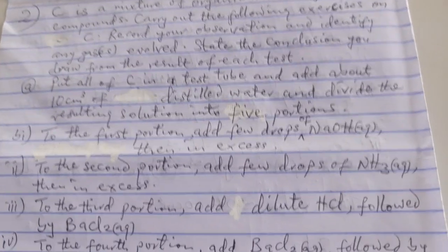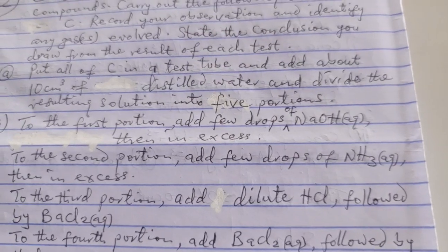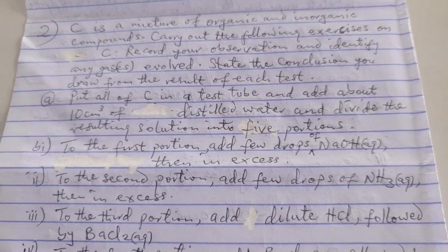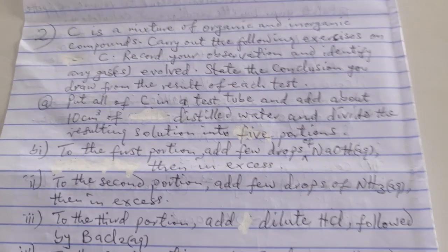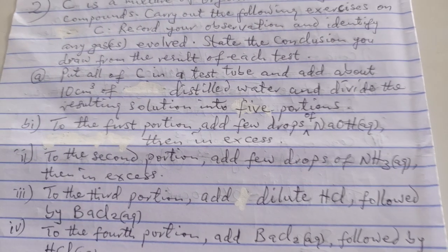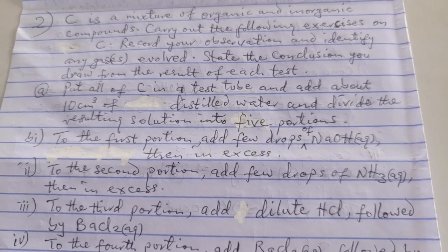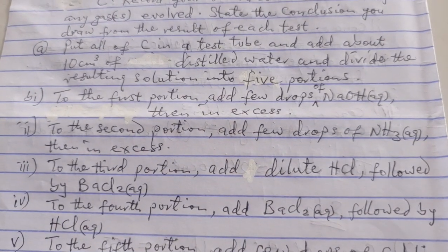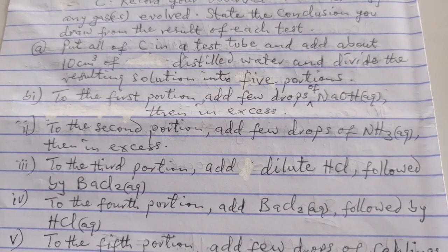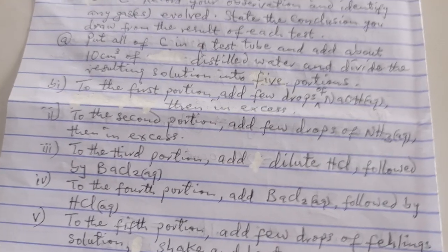To the first portion, add few drops of sodium hydroxide aqueous, then in excess. That means you add small, later you add in excess. To the second portion, add few drops of aqueous ammonia, then in excess. To the third portion, add dilute HCl followed by barium chloride.